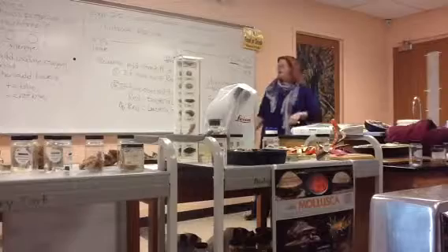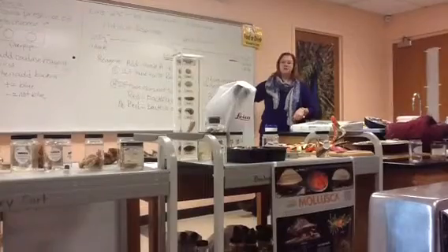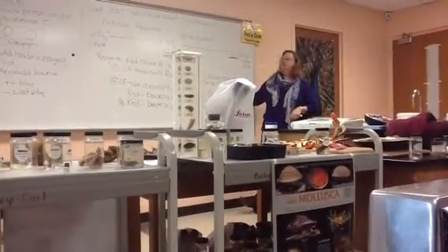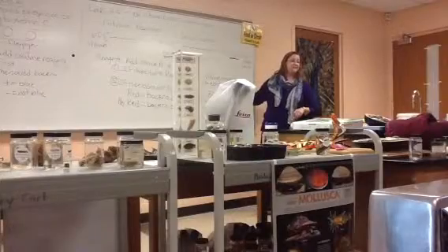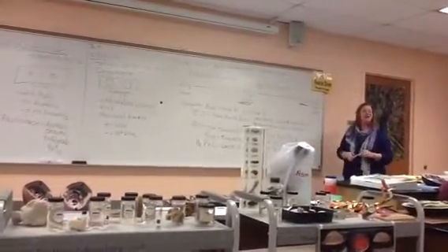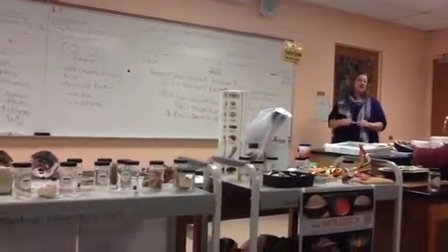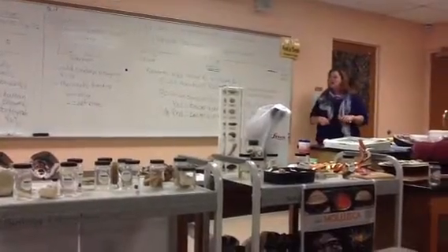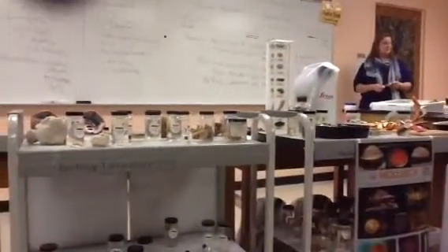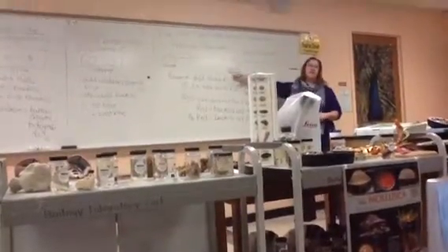The ones that did not turn red the first time, we get zinc powder. This is the chemical symbol for zinc. Ground up zinc metal powder. And this is hydrochloric acid, HCl. Only the H and the C are uppercase, the l is lowercase. HCl, hydrochloric acid. Zinc and hydrochloric acid, those two chemicals together, will chemically convert nitrate into nitrite. What is denitrification? Converting nitrite into nitrogen gas and nitrous oxide. That's a shift starting from here and going to there.